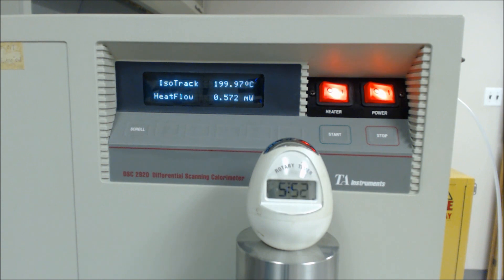However, a high pressure OIT test will require significantly more time to experience its onset in exotherm, and well over 1000 minutes should be allocated for the test after the T sub 0 is passed. However, if the technician does observe the exotherm before the DSC finishes its second iso track, they are welcome to stop the test, as no additional data is needed after the exotherm.